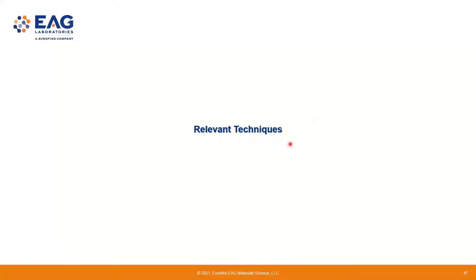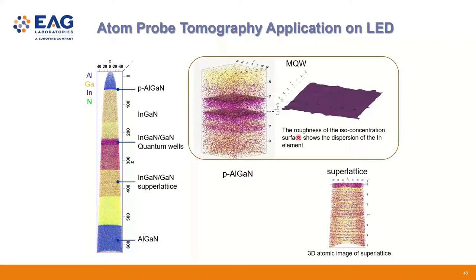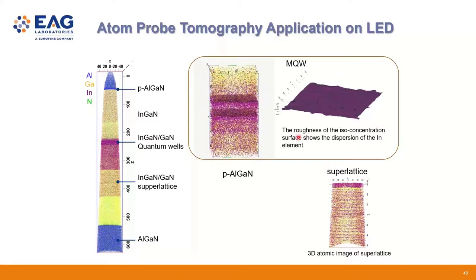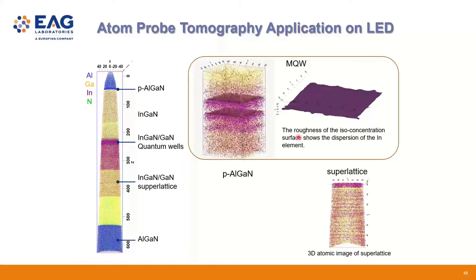For the silicon industry, or for material development in general, there are so many different techniques you can choose. Sometimes we were asked to provide dopant type of information. I always want to emphasize EELS at this point is not a dopant technique yet, right?